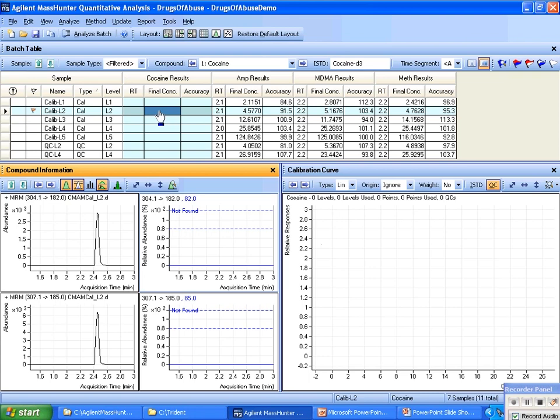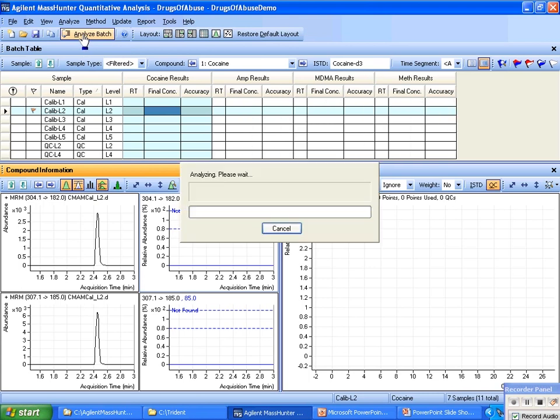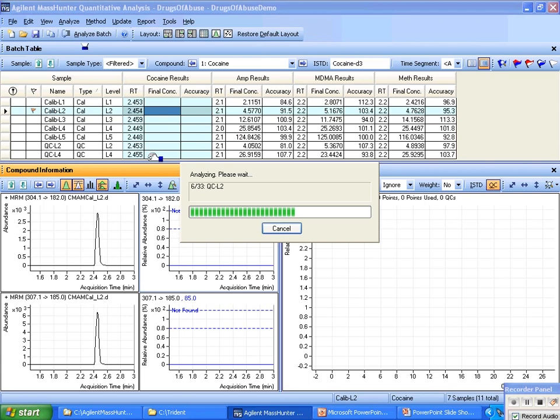So back to my original point, typically at the beginning you just have the calibration samples, and these calibration samples are used to build the calibration curve for this batch and this analysis. That is the typical scenario, and that would be done in the straightforward steps of extracting the signals, integrating, building the calibration curve, and then using that calibration curve to quantitate the results. So that's the norm of managing calibration curves, especially in LC-MS.